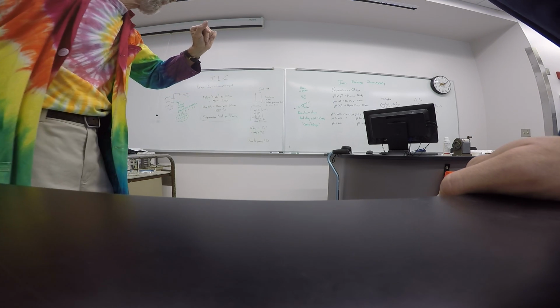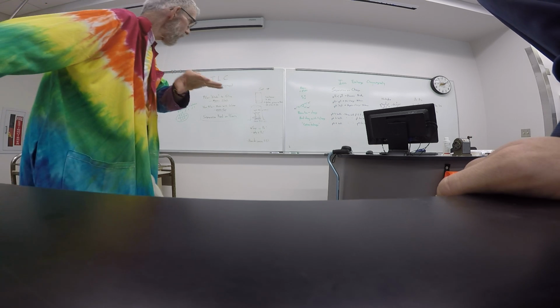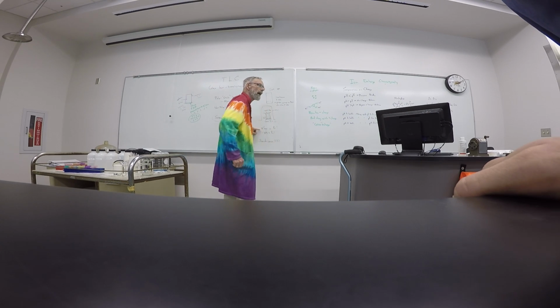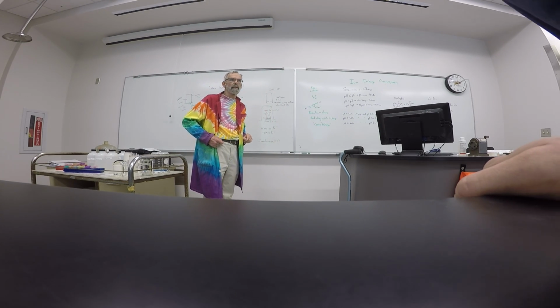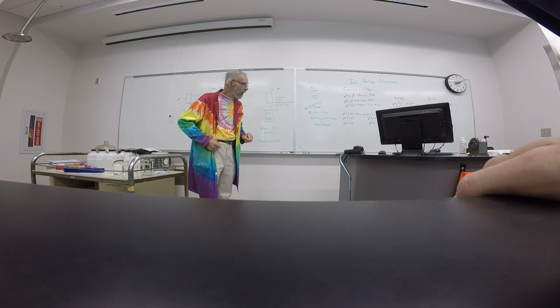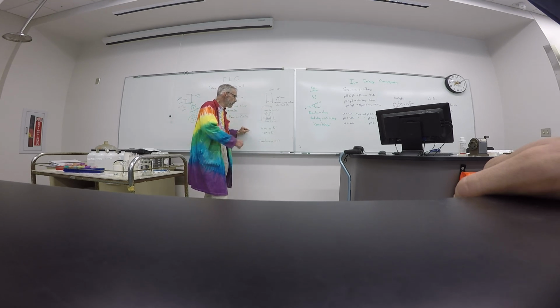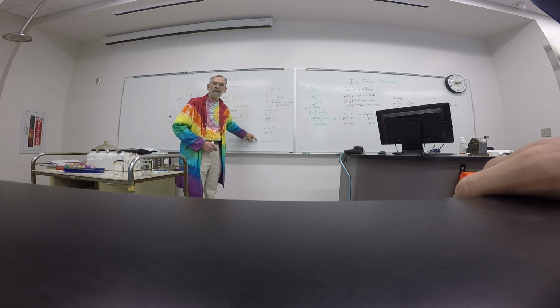Now the final thing, we'll assume that it all finished. What's this thing about an RF value? Anybody remember what an RF value is? Retention factor. And all that is a quick measurement of how far this guy moved up. Second thing is, how are you going to tell when you've got an amino acid?